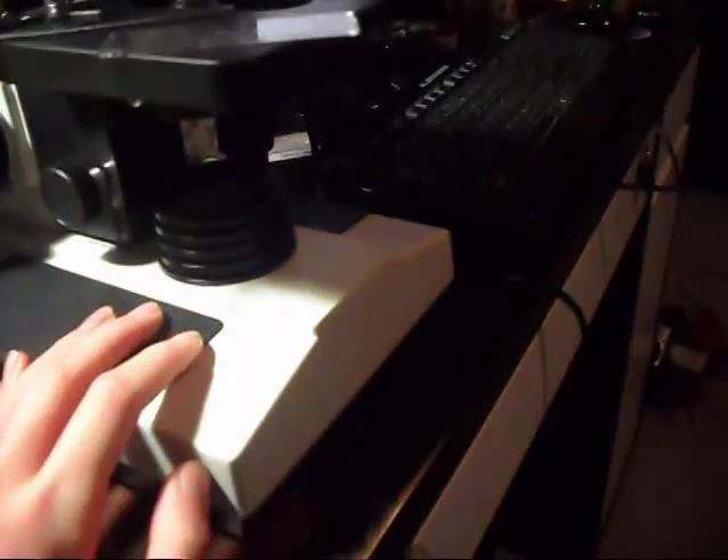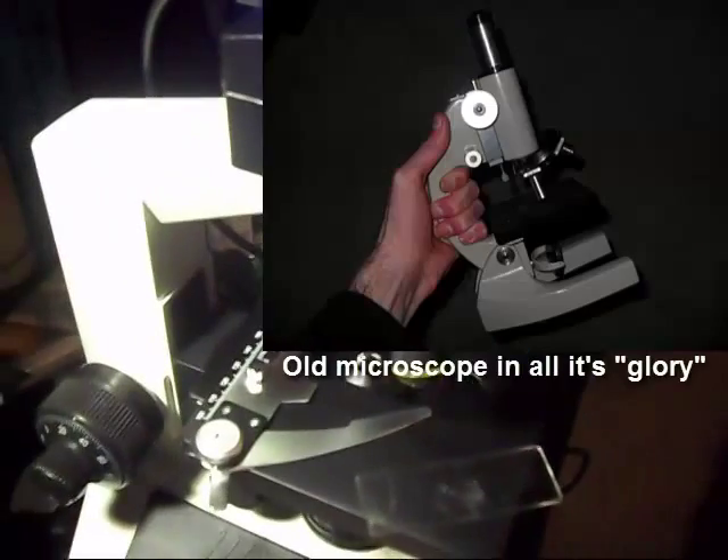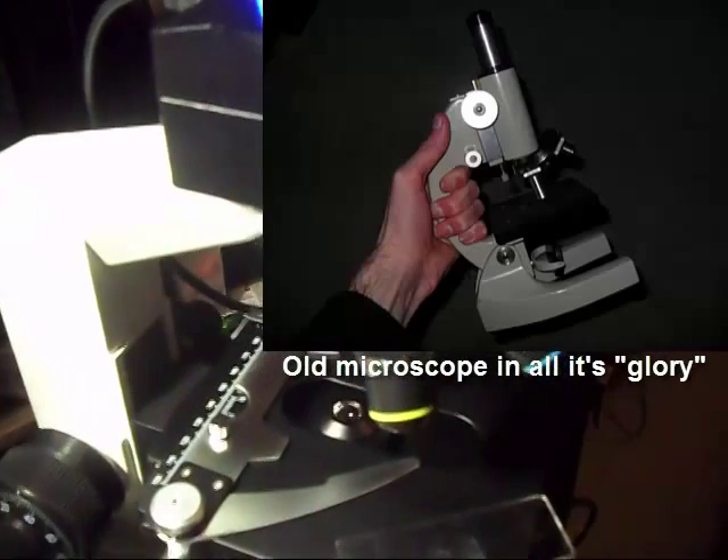Hello everybody and Happy New Year. I'm just going to show you a quick little video because I want to show off — I'm incredibly happy. This is actually a Christmas present for my dad. It is a new microscope because the last one I had was really crappy. There was a microscope supplier that had a sale going on this holiday, so yeah, this showed up.